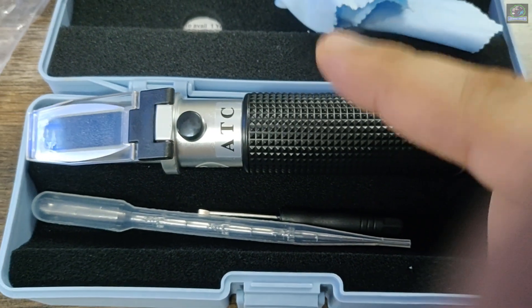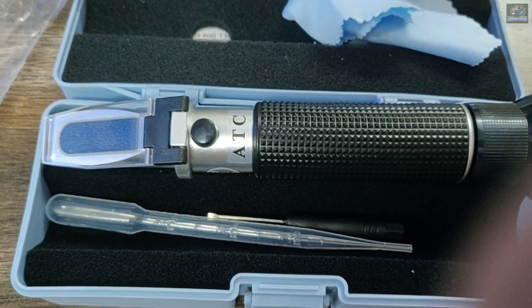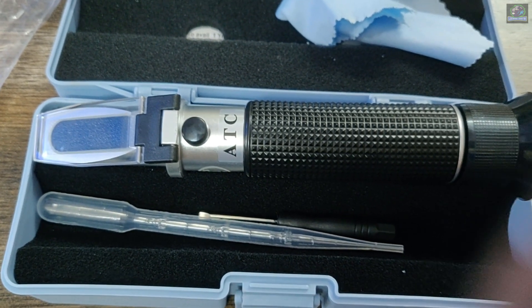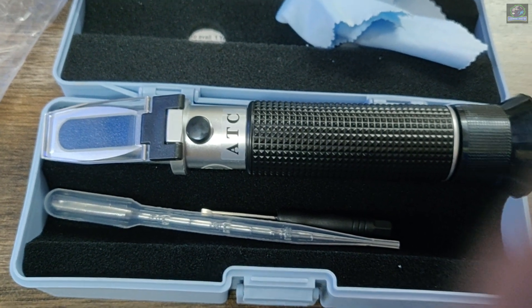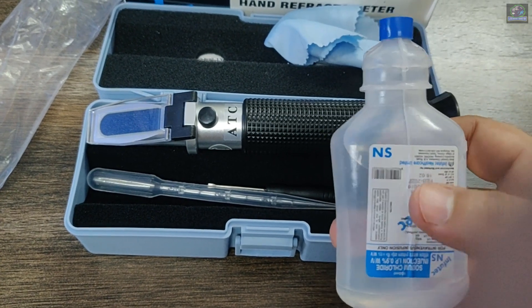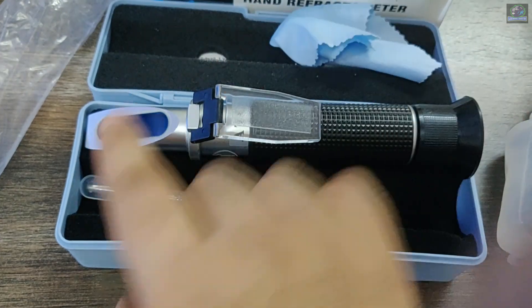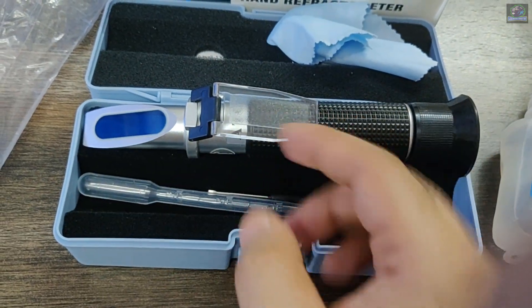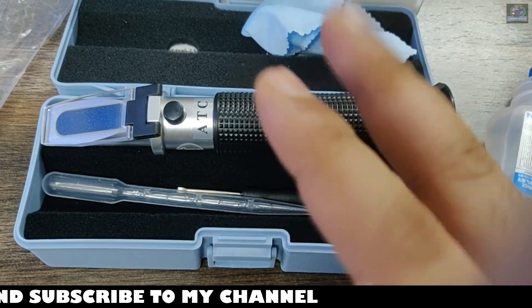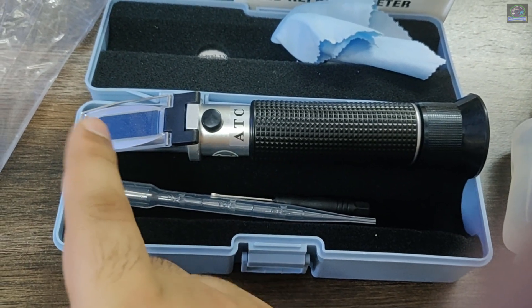When using the refractometer for the first time, you need to calibrate it — you have to bring it to the marking level of zero. To calibrate, you require distilled water, which you can get quite cheaply at a chemist. Add a few drops of distilled water to this area here and then calibrate the reading.